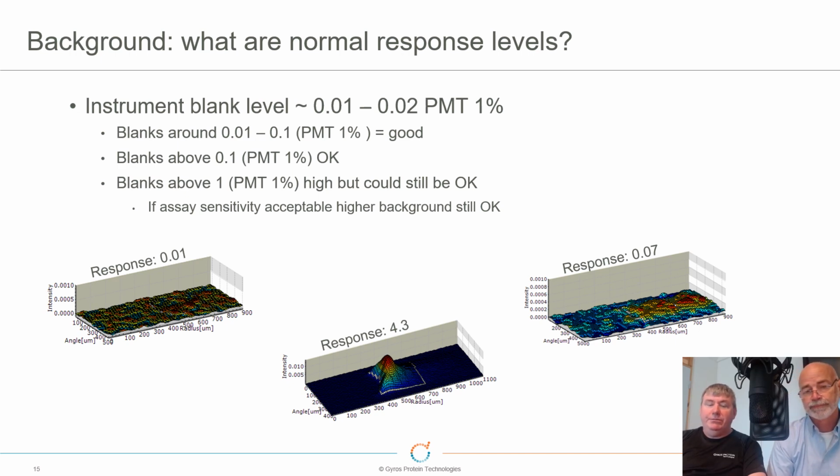Exactly. I still work on sensitivity being at least double the blank. So that means that in that case, your lowest standard or lowest point on your curve would probably be at least 8. So obviously that's really going to desensitize the assay.